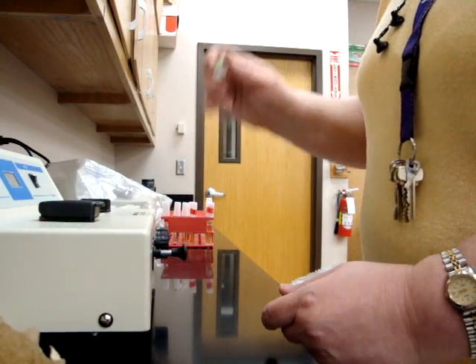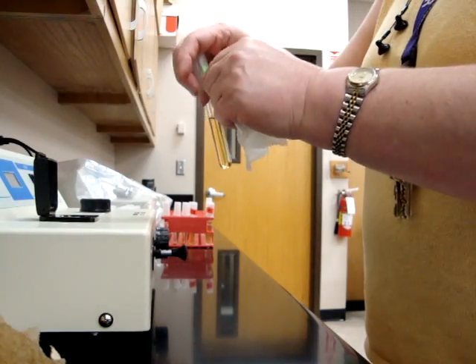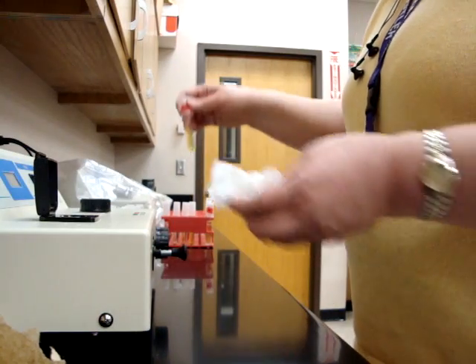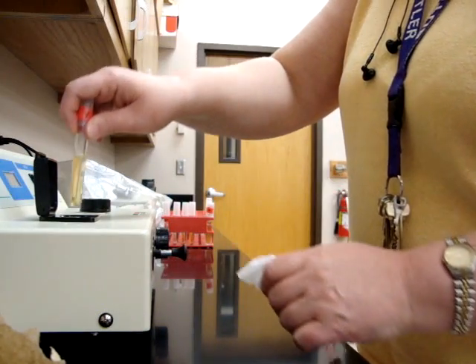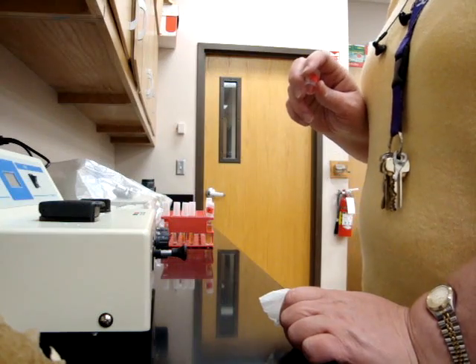Try not to get any fingerprints on it, and then zero it. When you're done with that, you are going to wipe off the test one in the same way, and then you're going to insert that into your spectrophotometer and read it.